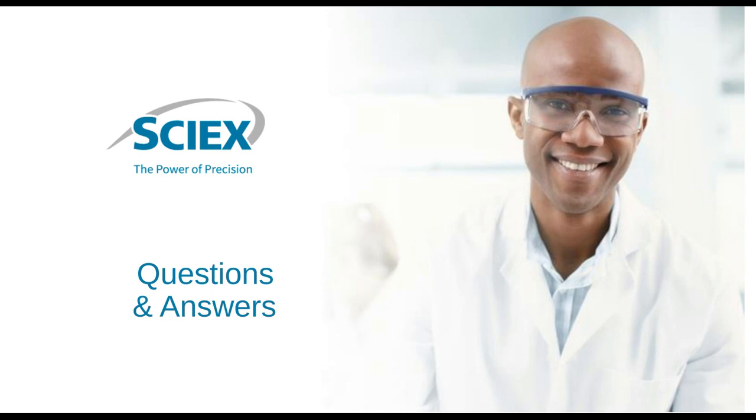Our first question is, can this approach replace DLS for size and ZP?